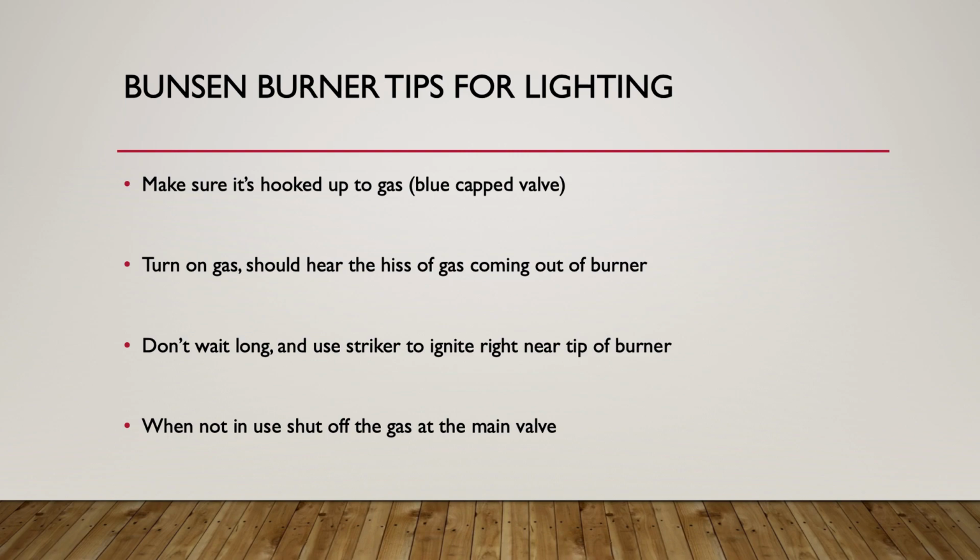And then when you're done with the Bunsen burner and you're not burning anything anymore, go ahead and shut off the gas at the main valve. Don't let it sit there burning unattended, and also don't shut it off just at the bottom of the actual Bunsen burner. That is absolutely never what you should do to shut the Bunsen burner off, because that could cause other issues as far as gas buildup.